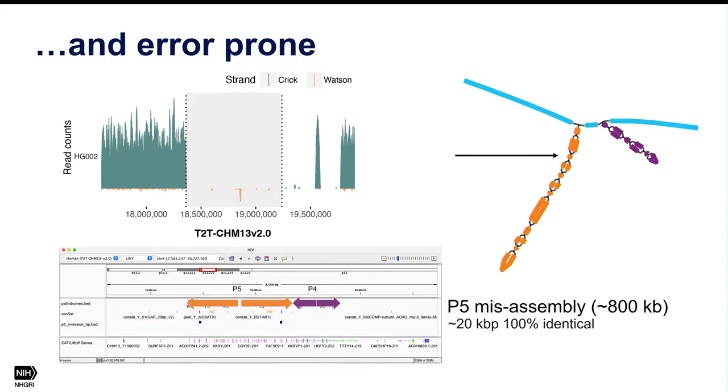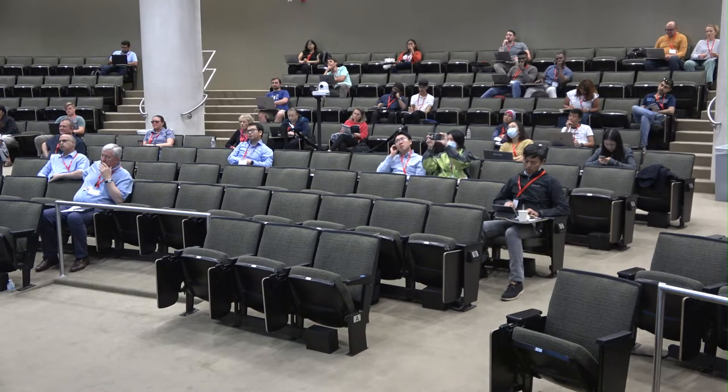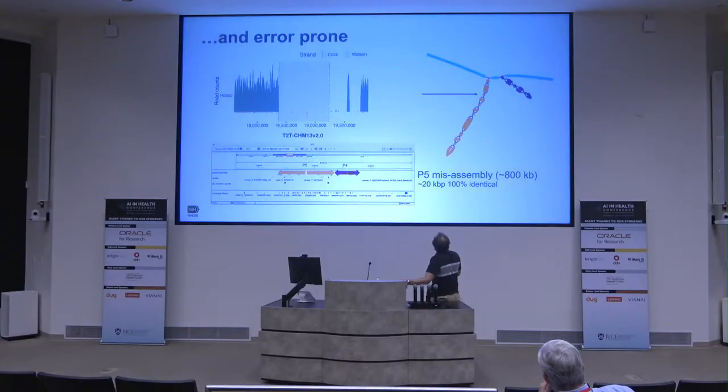And the reason it flipped is because it's a large hairpin, unlike the one I showed you before where there's just two nodes involved. Now there's a lot more. And you can see that this becomes a combinatorial problem because there's all the possible ways to combine, whether you go through this node first, then this node, and then the combinatorial explosion of every possible combination of these nodes along the way.